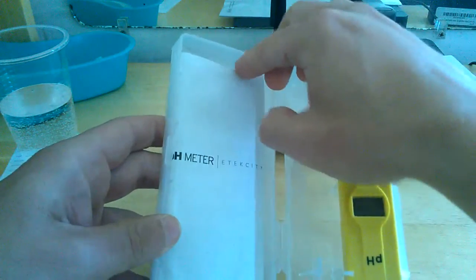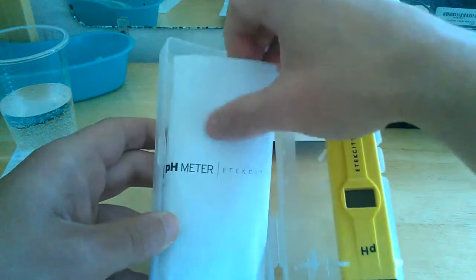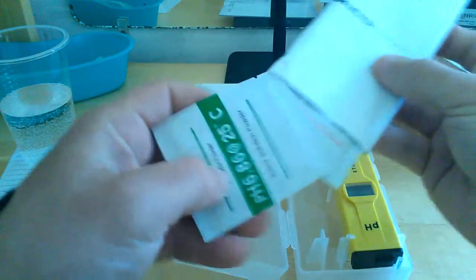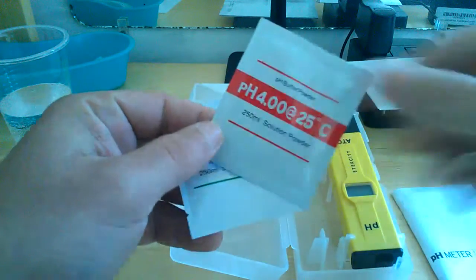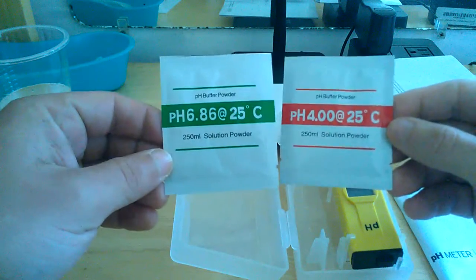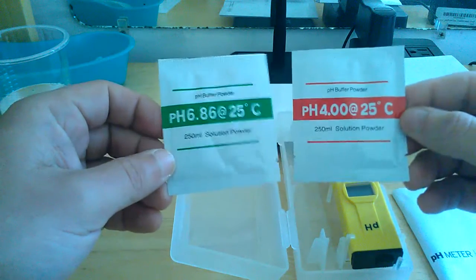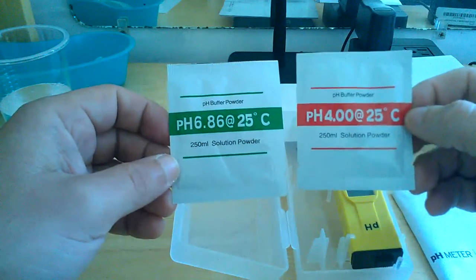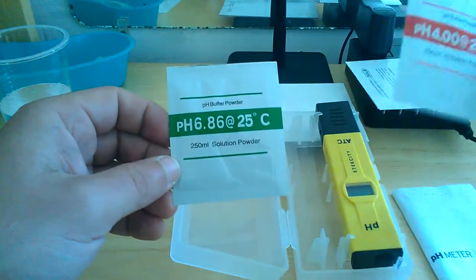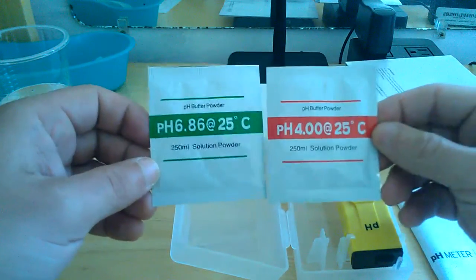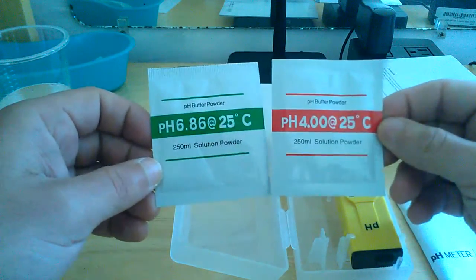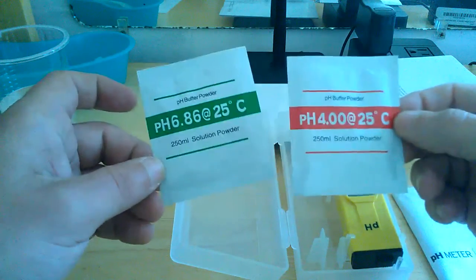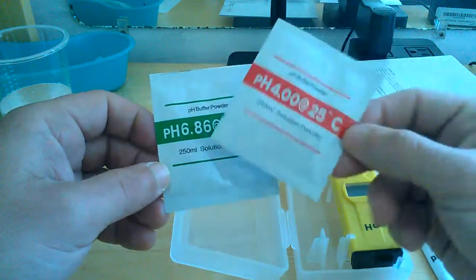Here is the instructions. I've just got them tucked into the top here for you guys. And inside that, like I was mentioning, the two calibration powders I've got there. Keep them in a cool dry place. That's why I have them in between the instruction manual there, just to keep them normal room temperature.